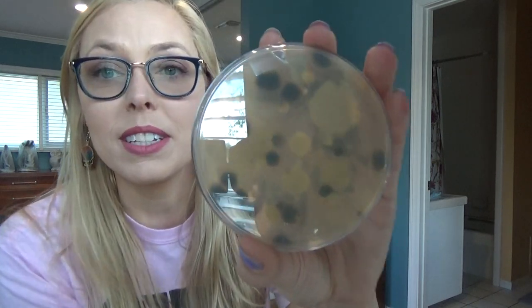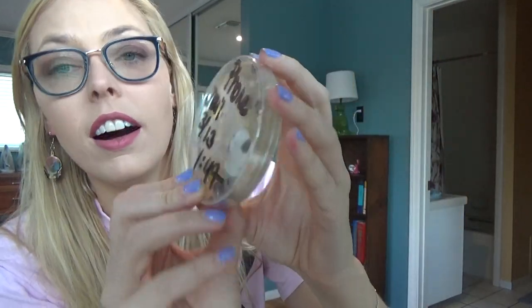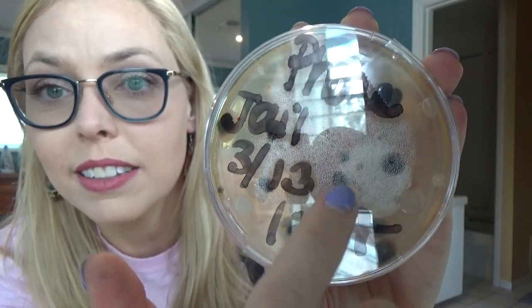Let's look at phone jail — how many of you missed phone jail? Phone jail — real icky stuff. There are a lot of colonies in phone jail, colonies on colonies. There's a big white spot with lots of little black spots inside. There's some bright orange, some bright yellow in there. This is another area I should probably spray down with Lysol, but bacteria is on everything, all the time.